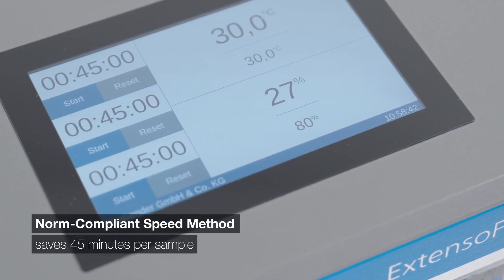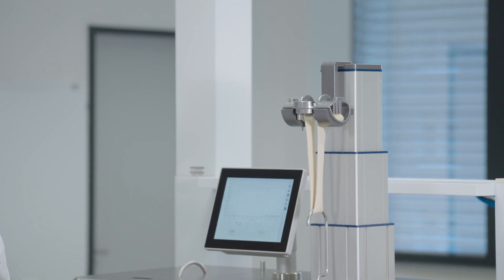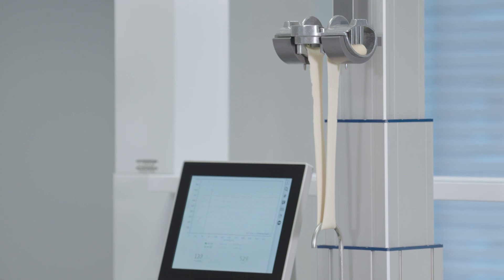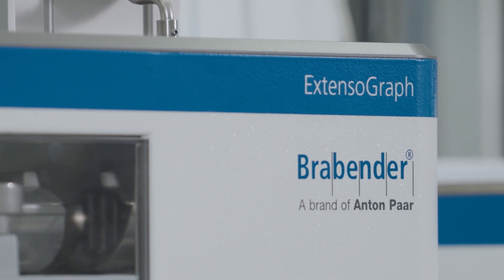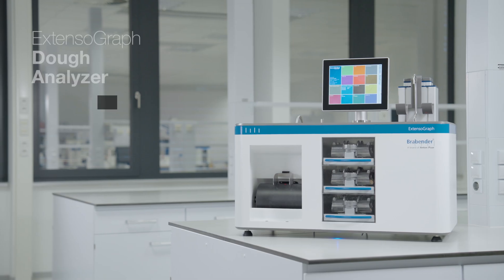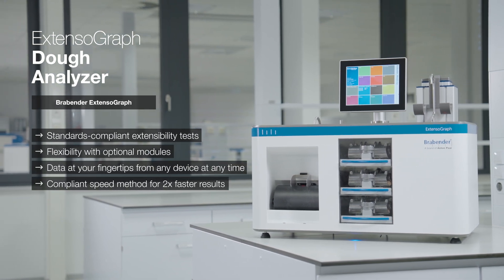The Extensograph's exclusive, standards-compliant speed method saves up to 45 minutes per sample. For those who refuse to settle for anything but the best, the Brabender Extensograph is the answer. Dive deep into the world of dough analysis, understand your materials like never before, and elevate your baking results. Dough extensibility, real-life reliability — this is the Extensograph promise.